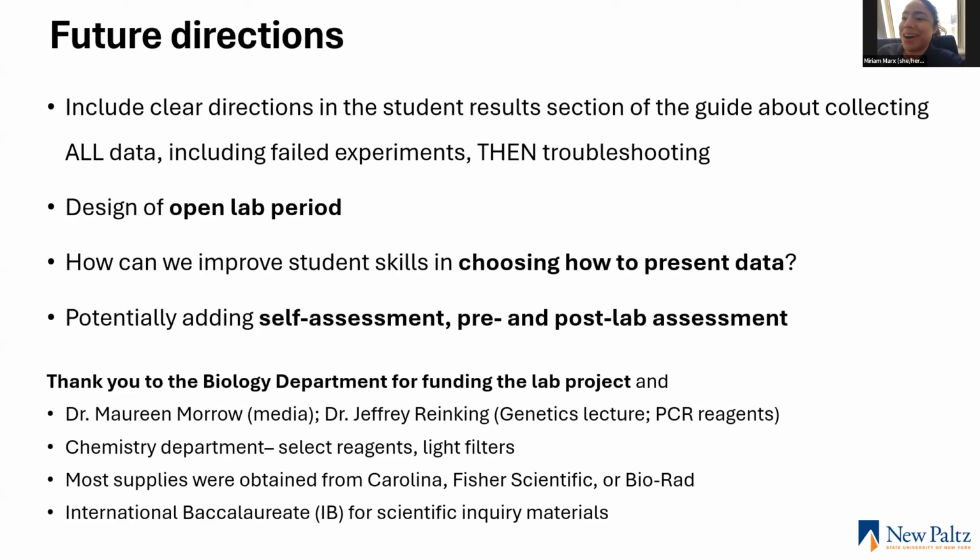One group wanted to put sunscreen on yeast to see if that affected the survival rate, but they didn't think to measure the amount of sunscreen and just sprayed it like they would on humans. They realized pretty quickly that they made mistakes, not just procedural errors, but also, I got results, but it's not answering the question I asked. I want people to make mistakes and realize that every experiment they've done in undergraduate has been heavily controlled by their instructors and play tested to be successful, but that's not the reality of science research.